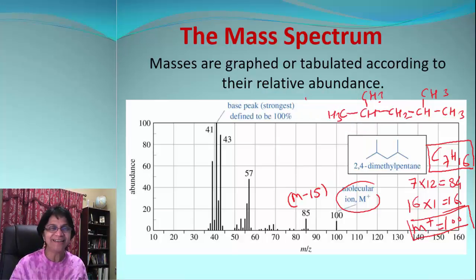It's another proof that we have an alkane or a structure which has a methyl group at the end. Now let's see if we take that pair of scissors and chop this molecule right across over here. We're going to get a fragment on the left side, this part, and we are also going to get a fragment on the right hand side. If you calculate the molar mass for the left hand side structure, that mass comes out to be 43.